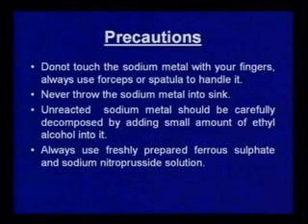Unreacted sodium metal should be carefully decomposed by adding a small amount of ethyl alcohol to it. Don't throw it into the sink if it has not reacted or if your fusion is not correct. That is not a safe way. You have to treat the leftover sodium with a small amount of ethyl alcohol, and then you can throw it. Now always use freshly prepared ferrous sulfate and sodium nitroprusside solution.